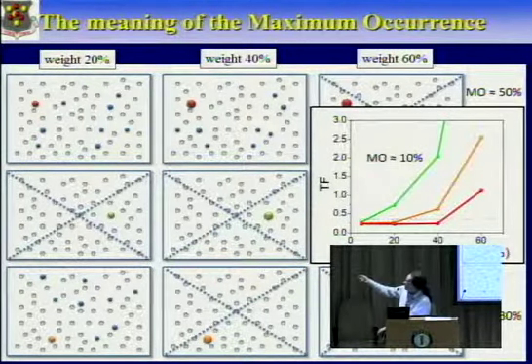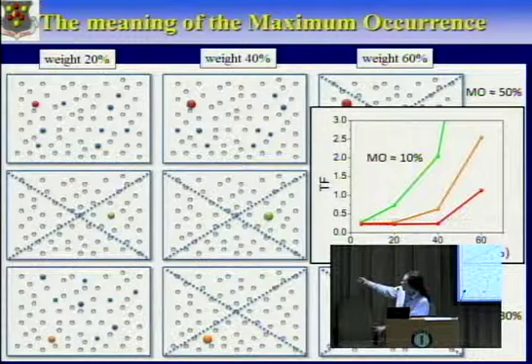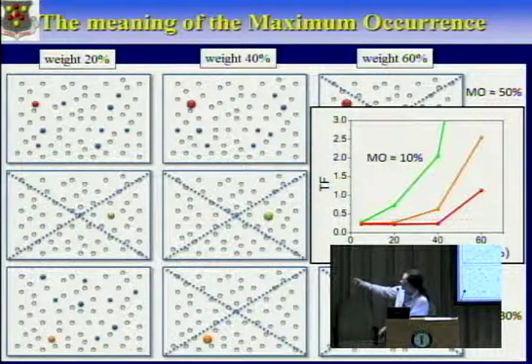So what you will get is that maybe the red structure is, let's say, stable or can be inserted in an ensemble with a weight up to 40% before the target function gets exceedingly high.